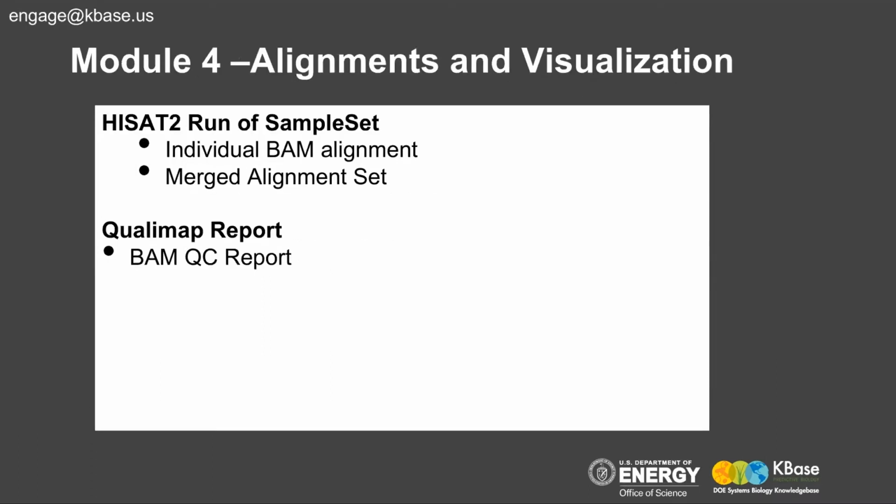For the alignment here for the webinar, we are going to use HISAT2. HISAT2 aligns RNA-seq reads to a genome and discovers transcript splice sites. HISAT runs far faster than TopHat2, and it also requires much less computer memory than other applications. So we are going to use HISAT2 here.